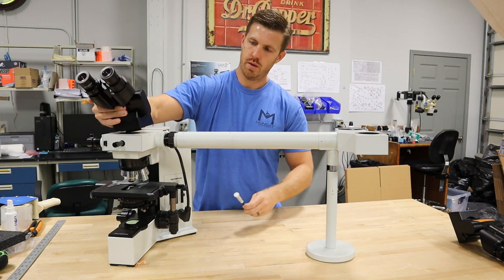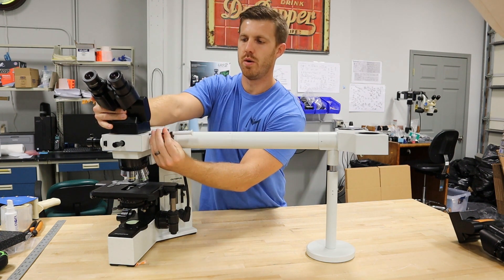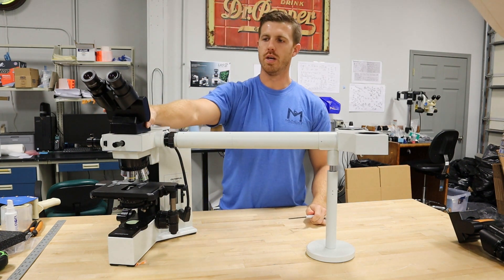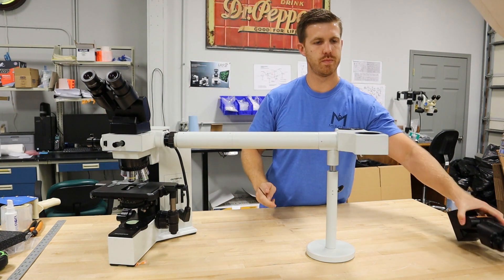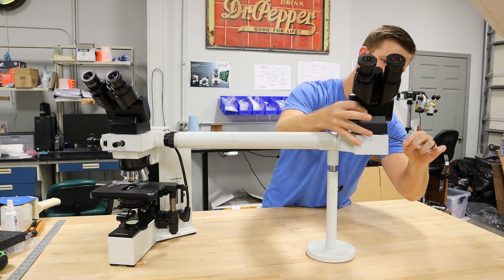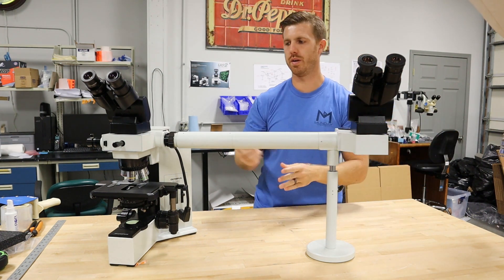So you put the head on. Make sure the flange is on there. When you're tightening things down, always make sure that you leave one hand on the item and then use your wrench on the other hand, and always wiggle it to make sure it's on there good and tight. Do the other head and you're all done.